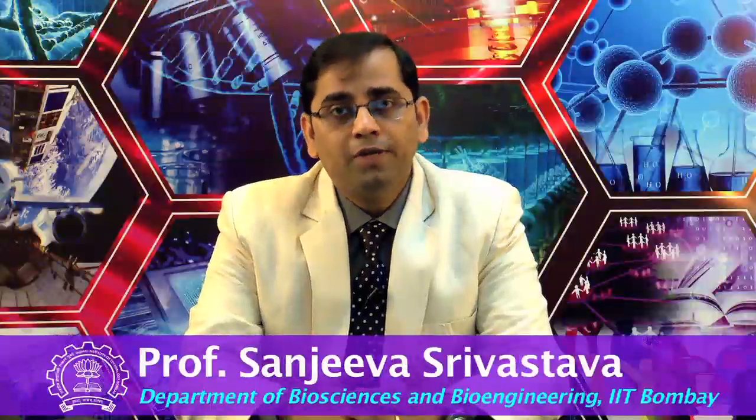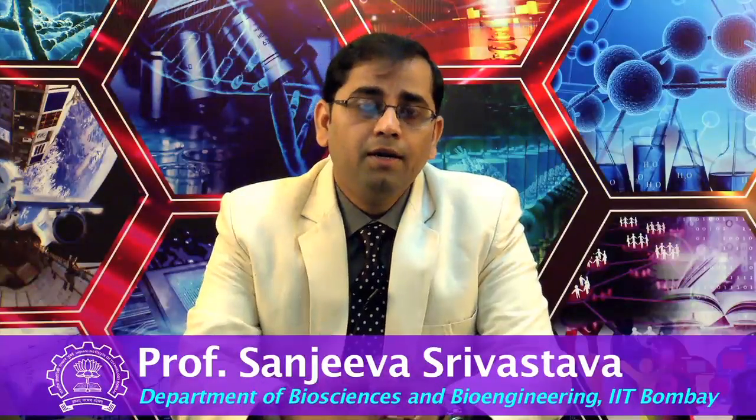As I mentioned briefly in the last lecture, if you are doing high throughput experiments, what becomes really crucial is what quality control checks you have done. While it is very easy to generate big data now with the advent of the latest technologies, especially in the field of proteomics and genomics, what becomes very crucial is how close attention you are paying to your reagents, their quality, your assay performance, the quality control checks for that, and your various control spots or control features, which should guide you on whether the experiment works or has a lot of non-specific values.